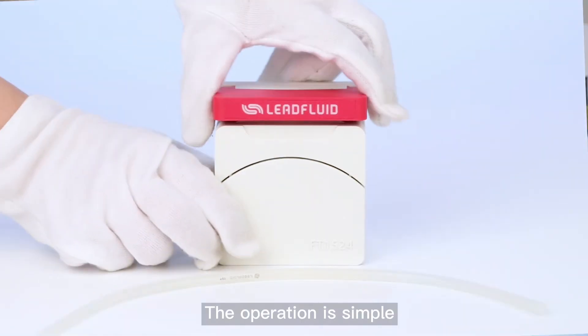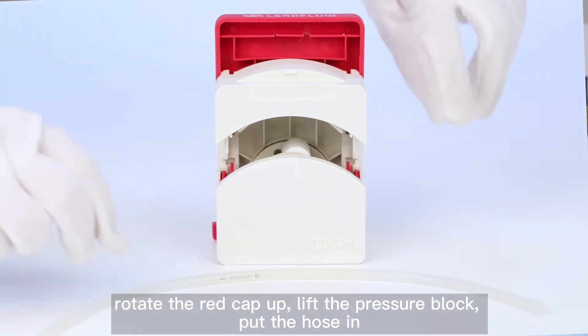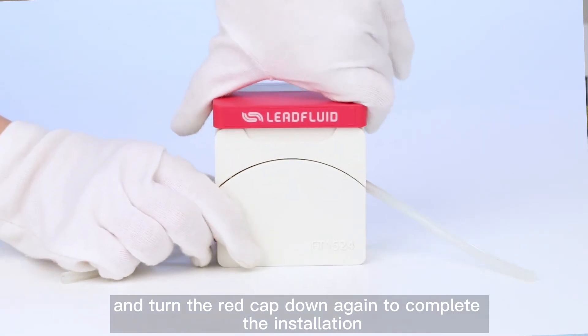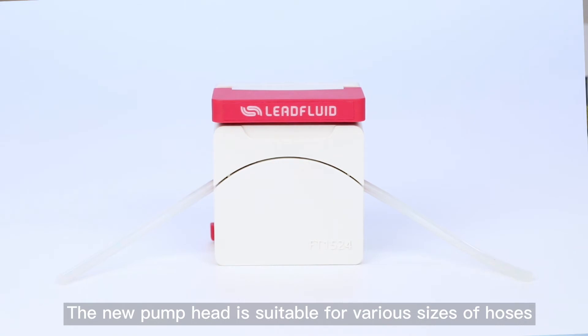The operation is simple. Rotate the right cap, lift the pressure block, put the hose in, and turn the right cap down again to complete the installation. The new pump head is suitable for various sets of hose.